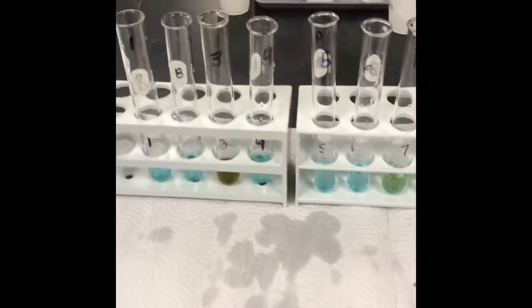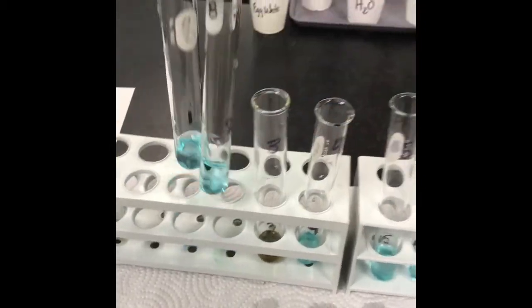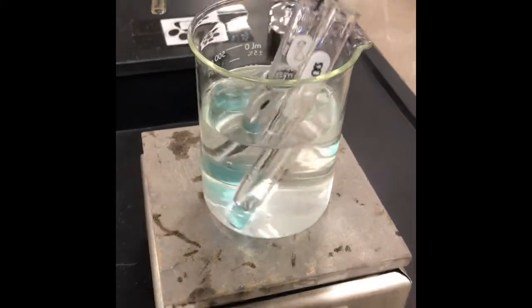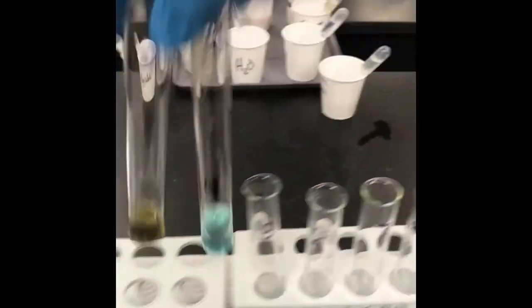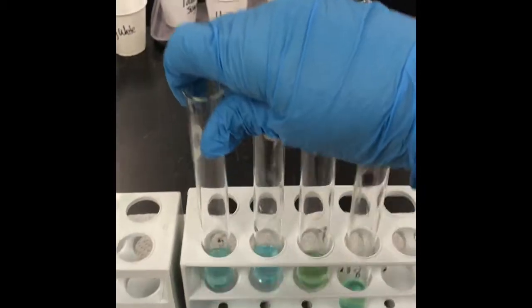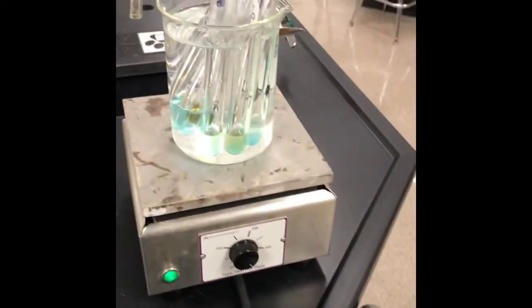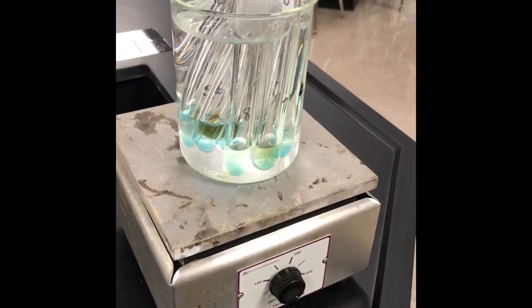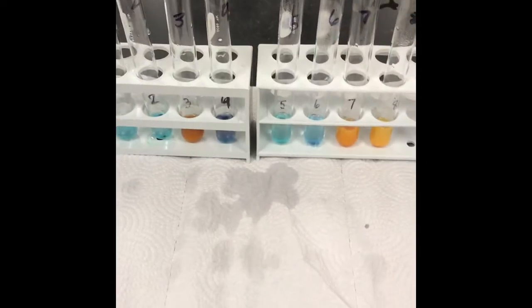Now we are ready to take all the test tubes. I just pick them up like this, and we're going to put them in the hot water bath like so. We're going to put all of them in here at the same time. Yes, we can fit all of these in. There we go. And we're going to start our timer for 4 minutes and see if we get any positives by changing to orange.